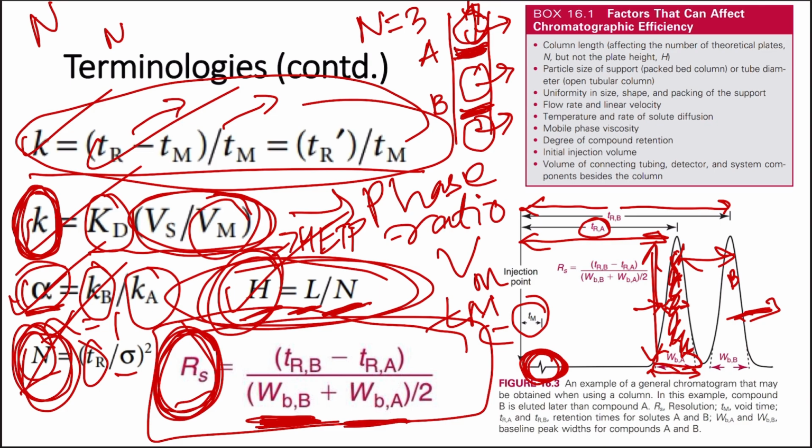So far what we were seeing, the retention times are different for different components, and when we compare them with the list we have of the standards, we can easily find out that this is that particular component. But to know the amount of that component in this particular mixture, we need to know the area, that is the peak area, the area under the peak. So that will give us the idea of the amount of the particular component present in that mixture. So that is about the peak area and the height.